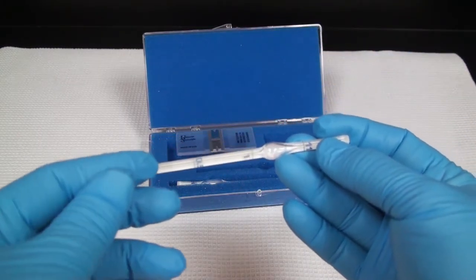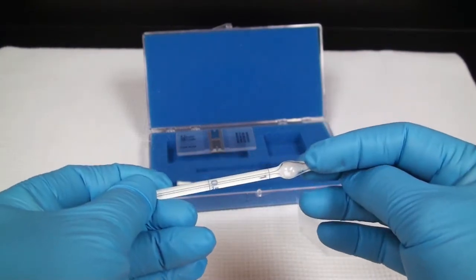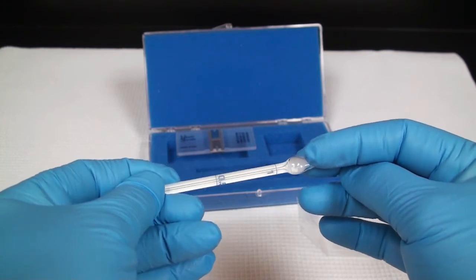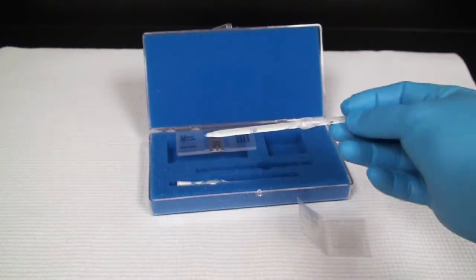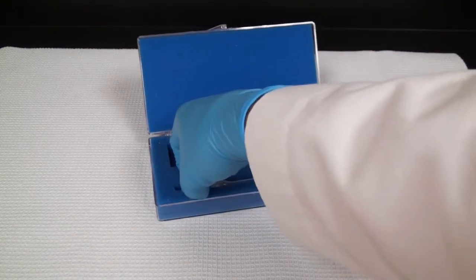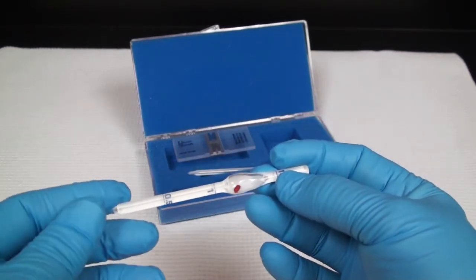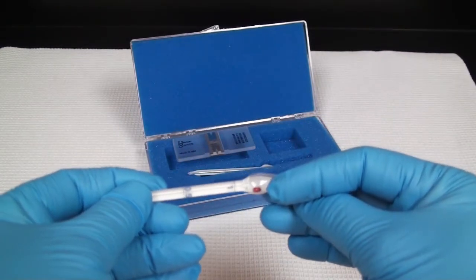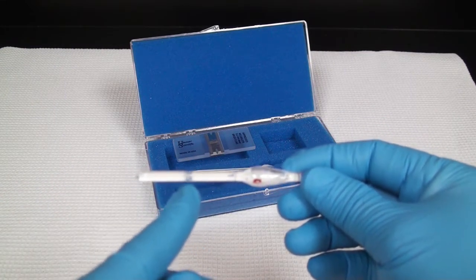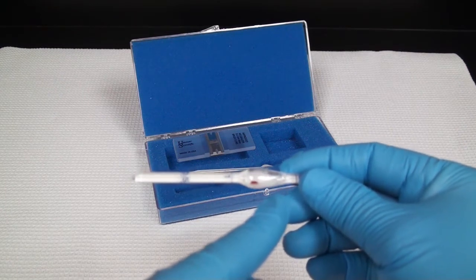The kit also comes with a white blood cell meter, which provides a 1 to 20 dilution depending on what you're counting. The other chamber is used for red blood cells, and that would be doing a 1 to 200 dilution. That all depends on the concentration of your cells or particles that you're counting.